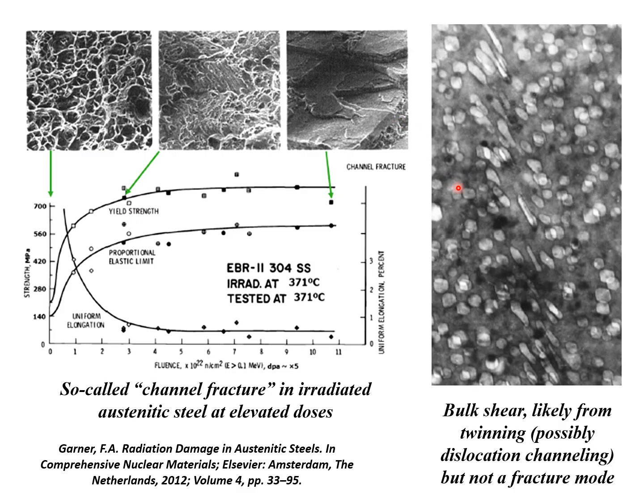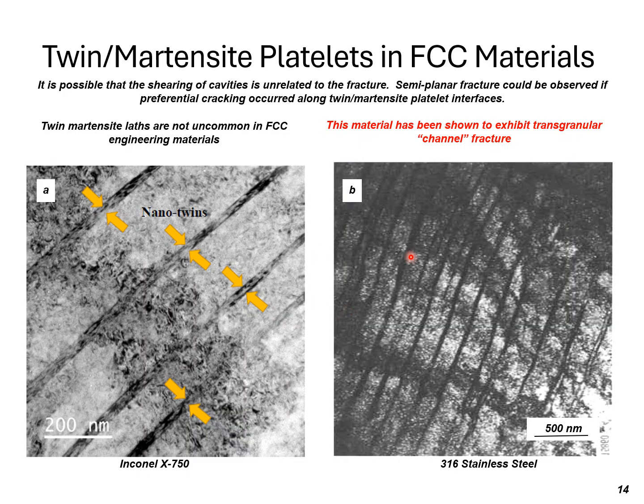And one of the reasons that I can make that kind of statement is in the same material, in the same work, Garner and company also, I guess the microscopy also said, well, I'd like to put this information in there. And that was some of the archive material for that steel sample that was irradiated. There were some grains, and so not all grains. It's like deformation is very non-uniform in most engineering materials. In some grains, there was evidence of what was identified as epsilon martensite.